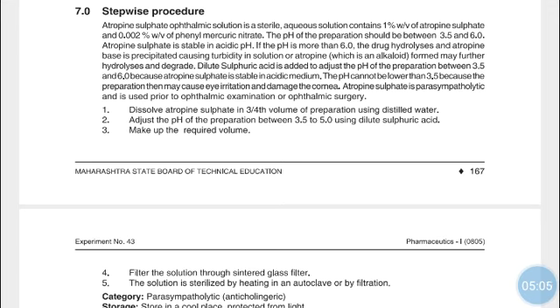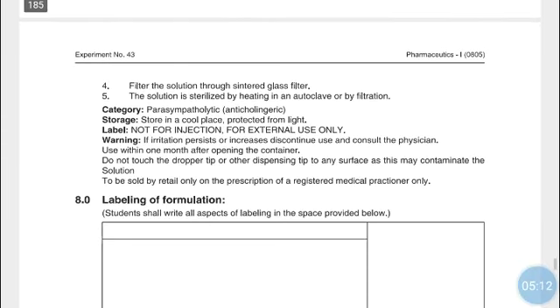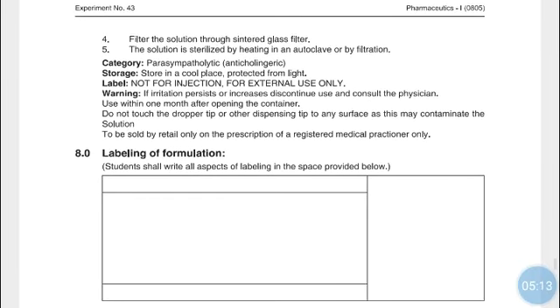Then make up the required volume, add the required quantity of Phenyl Mercuric Nitrate, filter the solution through a sintered glass filter, and sterilize the solution by heating in an autoclave or by filtration.